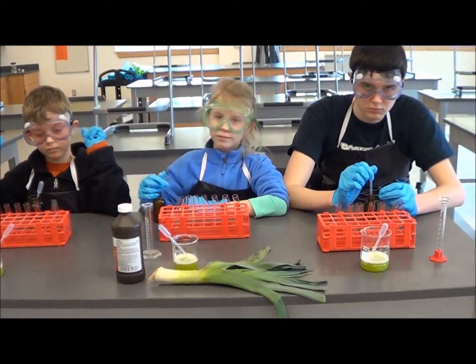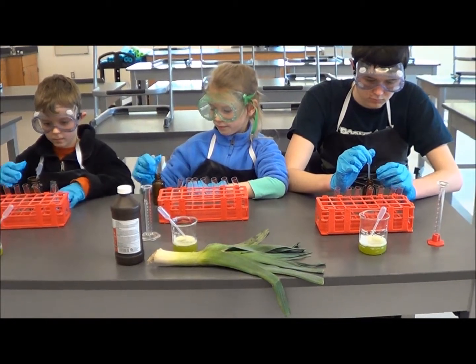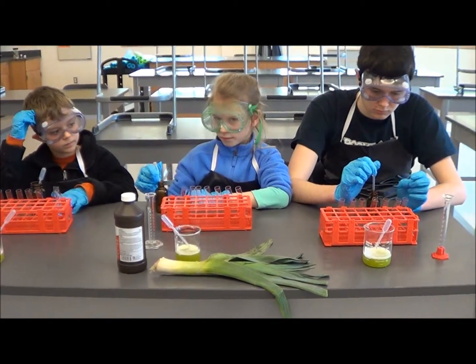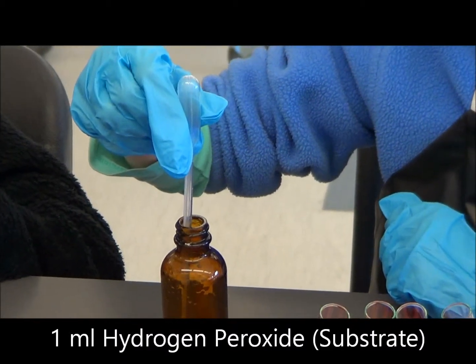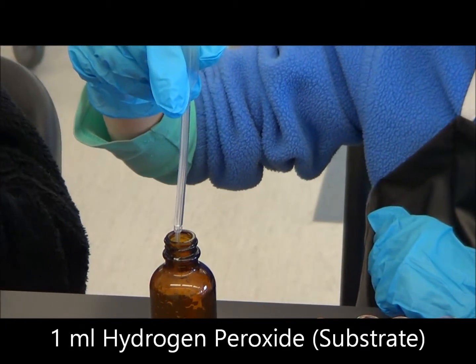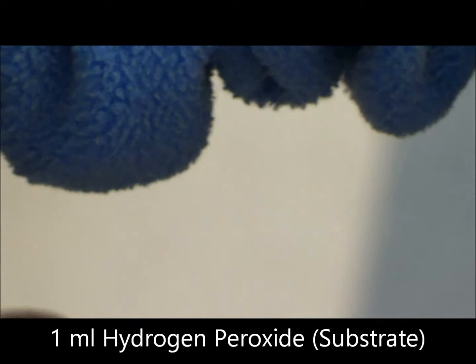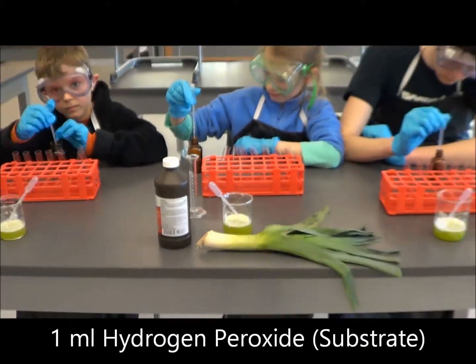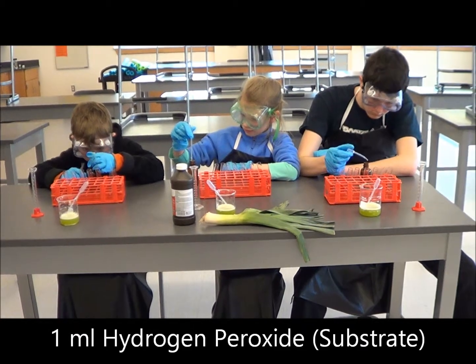Now what we're going to do is put one milliliter of hydrogen peroxide in every single test tube. We're going to demonstrate that. Squeeze the pipette - what line do you put it up to? Go ahead everybody, one milliliter in each of your seven test tubes.